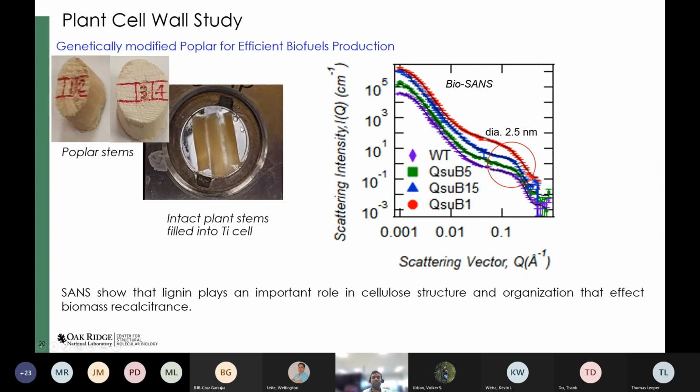I am showing here, not purposely, that if you can see, there are air bubbles. This kind of air bubble you can get rid of maybe by simply tapping the cells, but sometimes it is also not easy to get rid of by simply tapping. In that case, we have to take all the solvent out and refill it. If that does not work, we have to reassemble the cell.